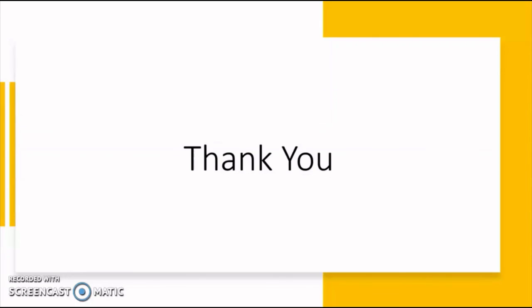This brings us to the end of our video. The basic instrumentation presented here can be applied to most brands and types of GC systems. In future videos, we will take a closer look at the chromatographic data and how variation in the system can produce different types of peaks.